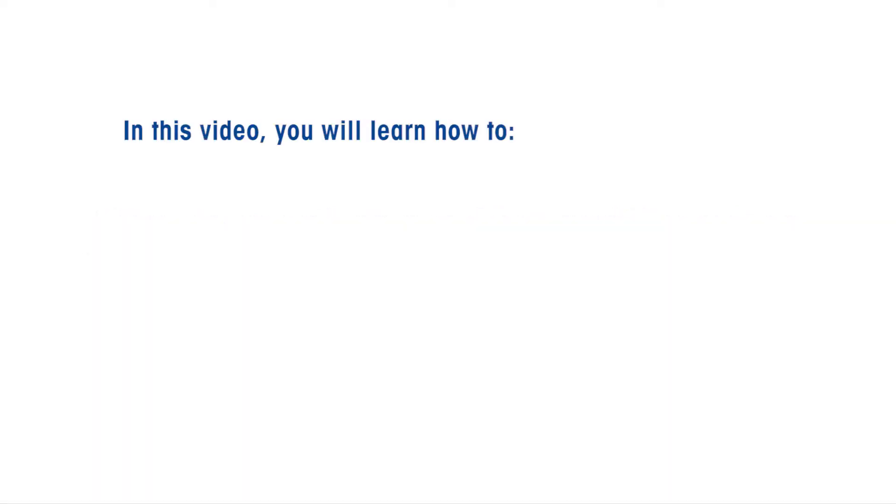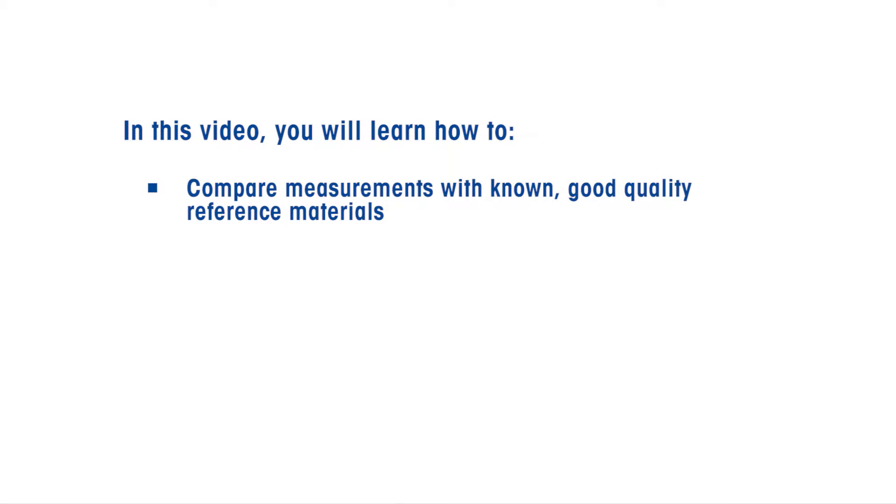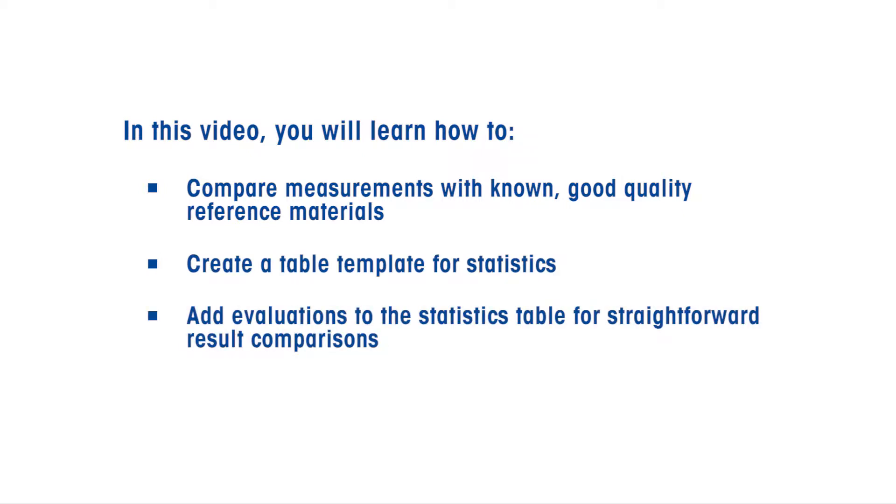In this video, you will learn how to compare measurements with known, good quality reference materials, create a table template for statistics, and add evaluations to the statistics table for straightforward result comparisons.